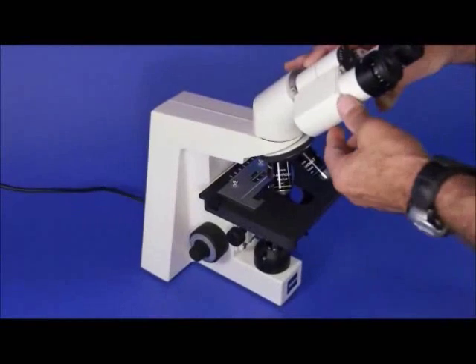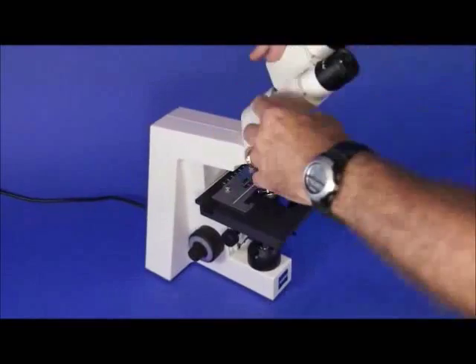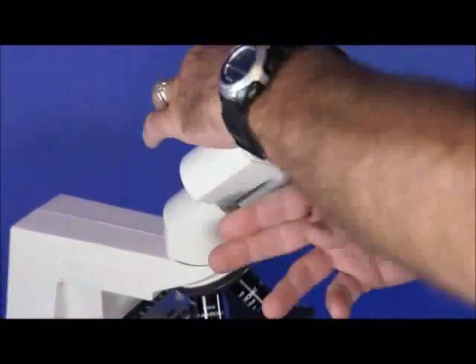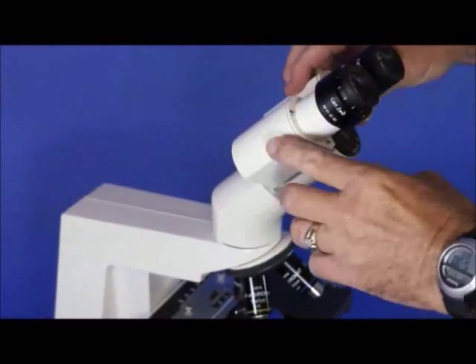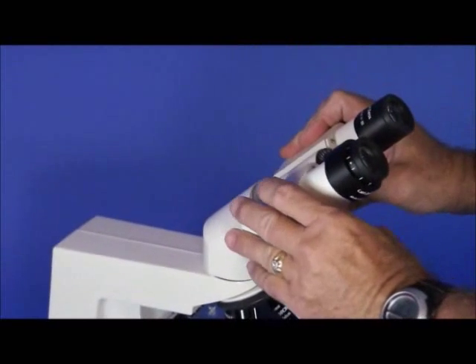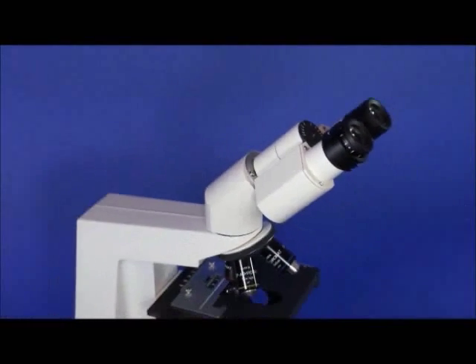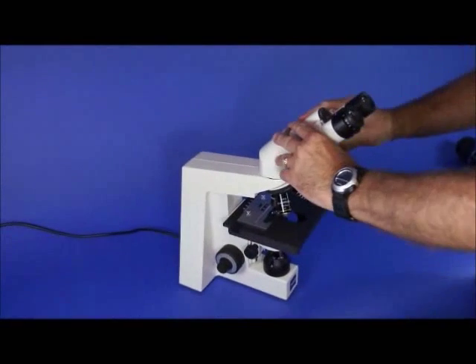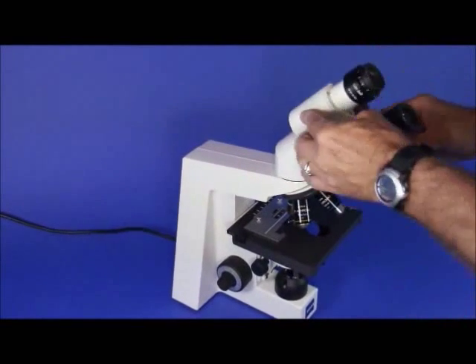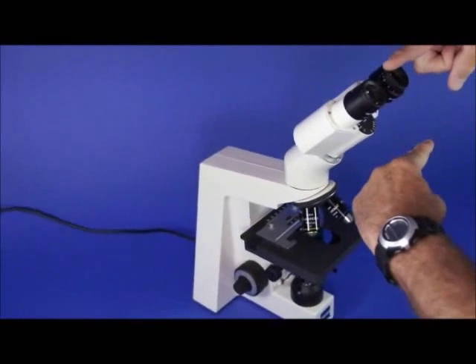A couple of really nice things about this Zeiss Axiostar: the head rotates 360 degrees. The way this is really advantageous is — let's say you're looking for an inclinable head which is going to give you extra height for people with different torso lengths. You can sit down and if the height is too low, you just turn it around and you've got all this extra increase in height.